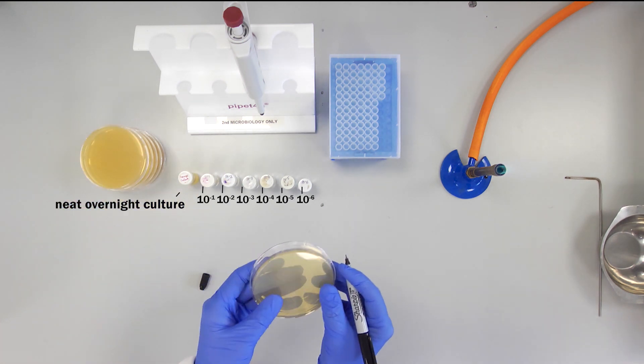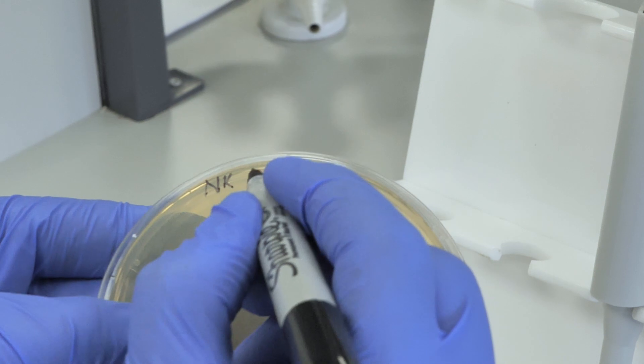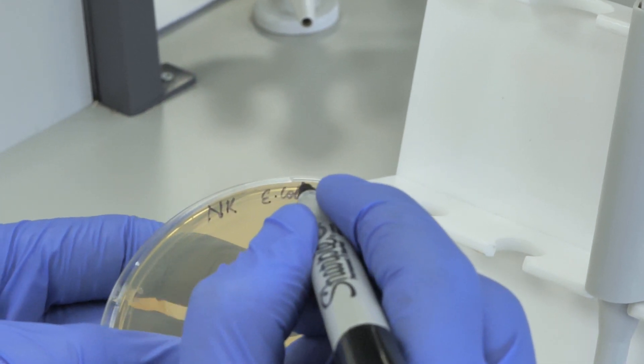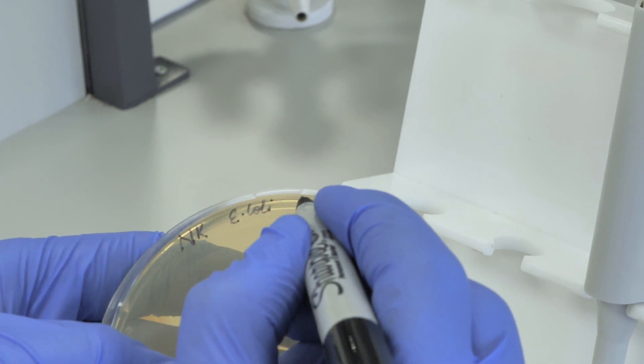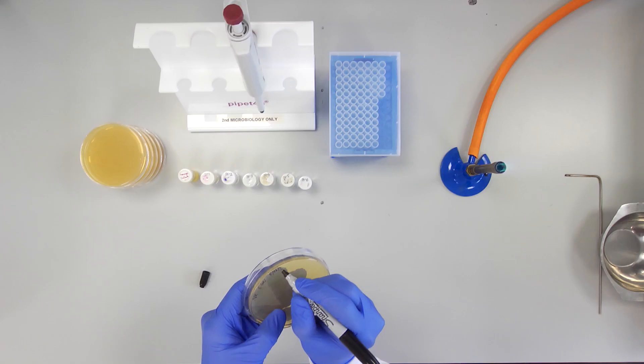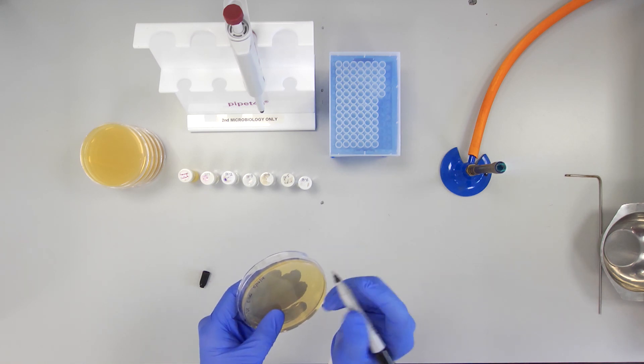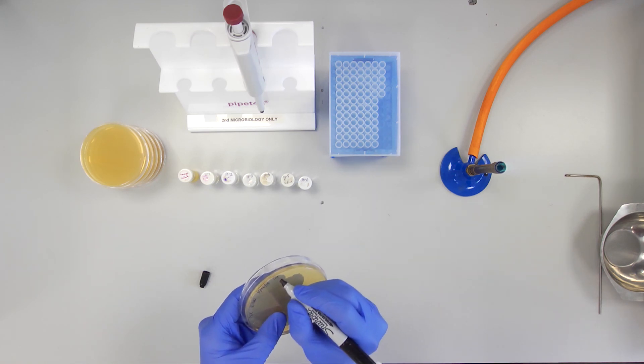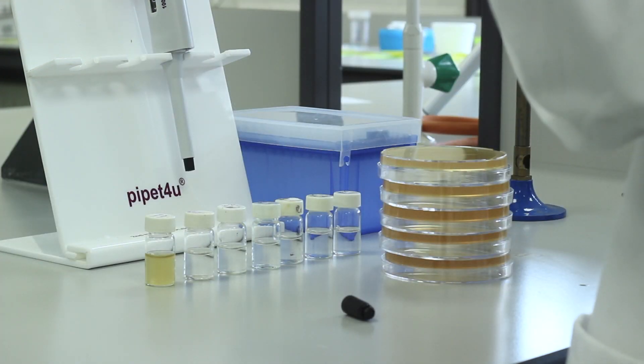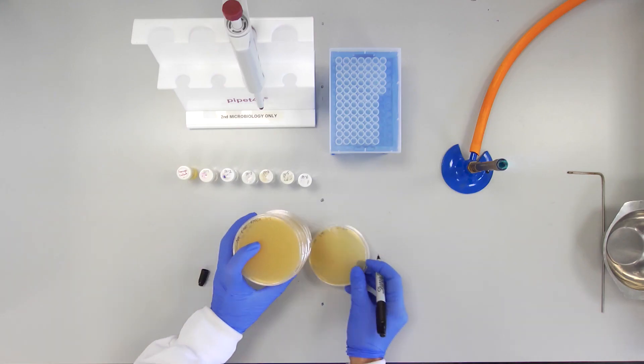Label the bottom of each plate with your name or initials, the dilutions from 10 to the minus 1 on the first plate to 10 to the minus 6 on the last, the name of the organism being tested, and the date. These plates can now be set aside.